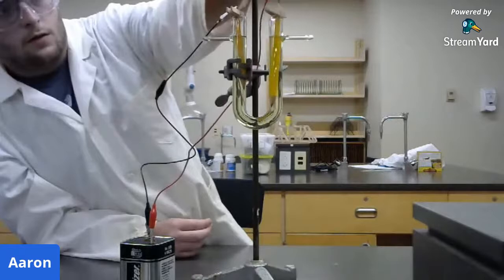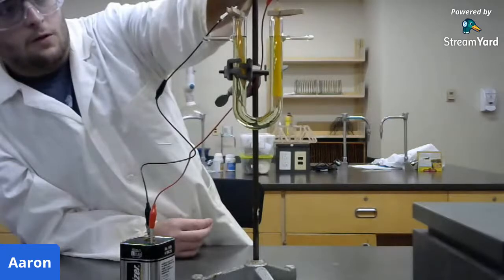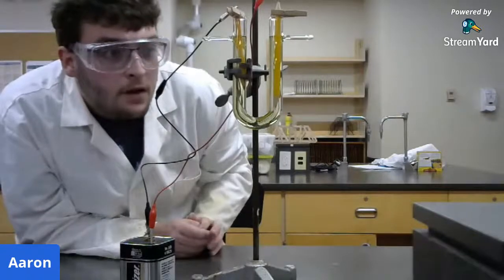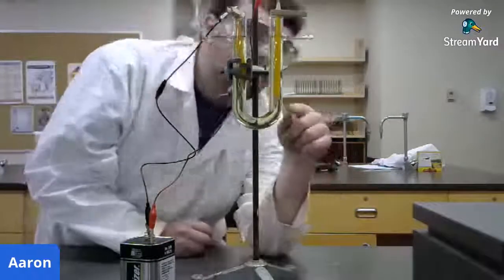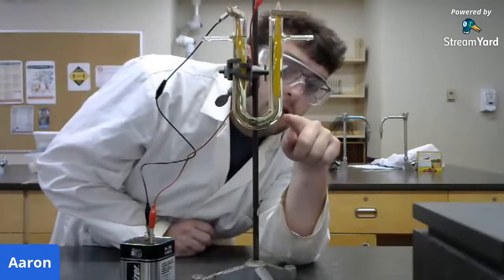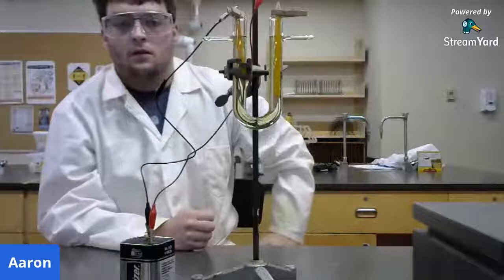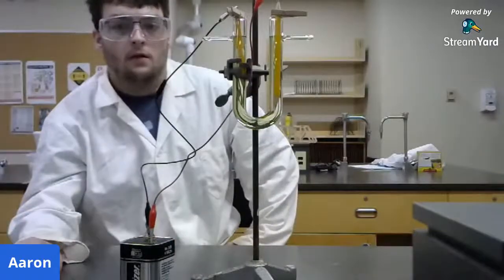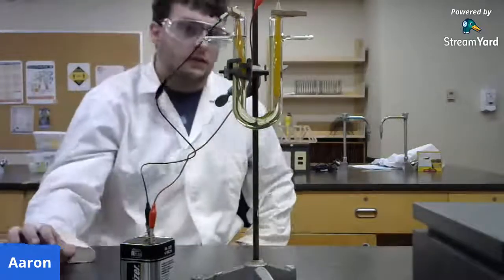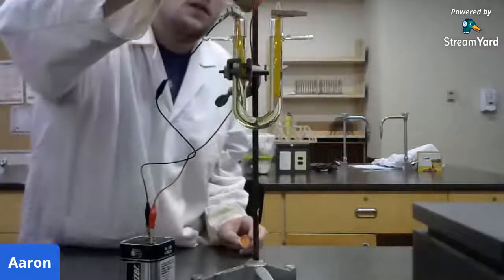To rearrange this. That's the fun thing about science, it doesn't always work the way you want it to. So now, you're probably not able to see it, but there are bubbles forming on the leads of the pencils. This reaction is pretty slow at first. And in fact, we can probably add a little bit more indicator.